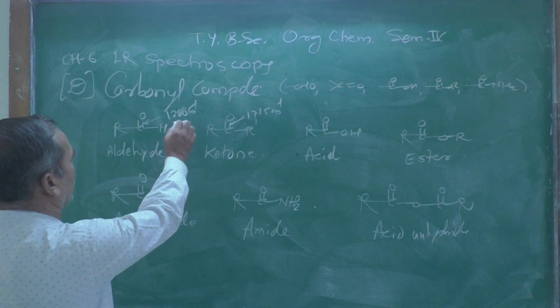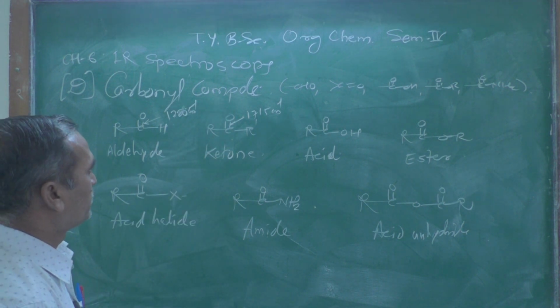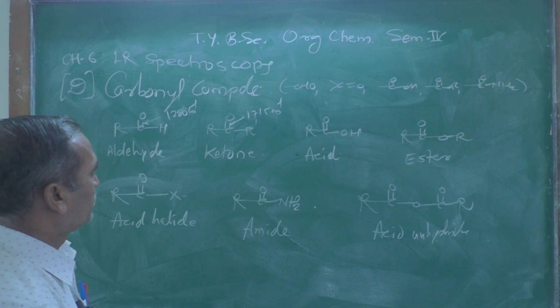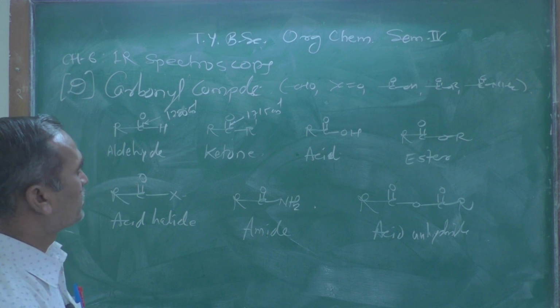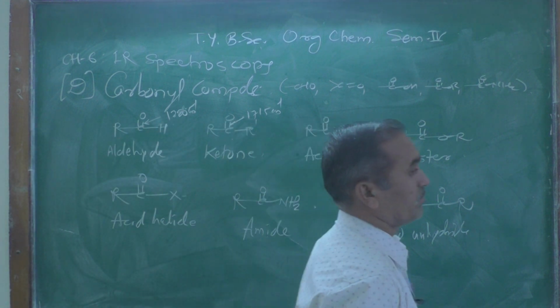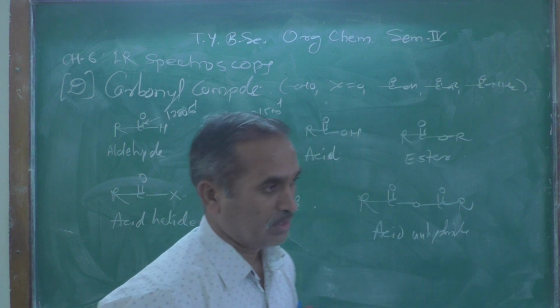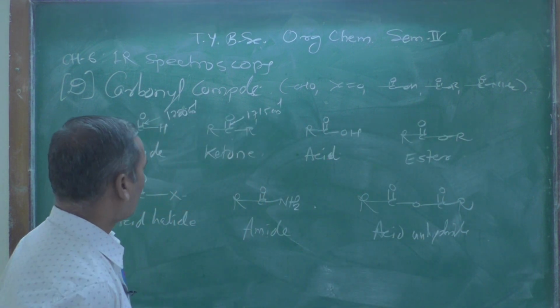A peak at 1720 or 1715 per centimeter observed clearly indicates that the compound is a carbonyl compound.